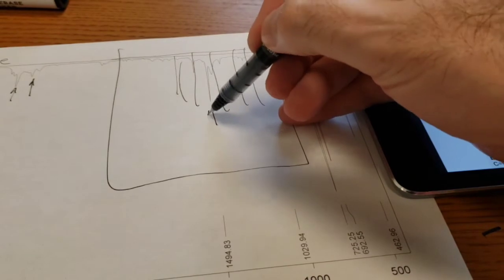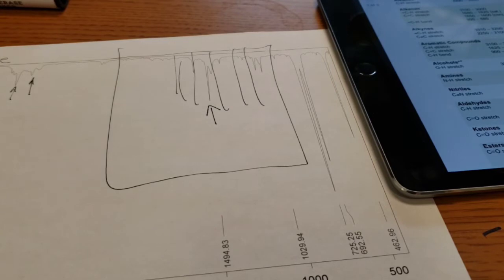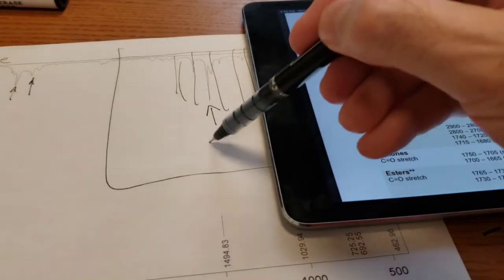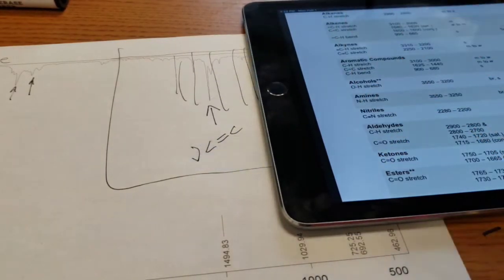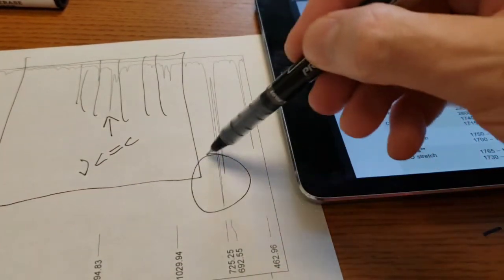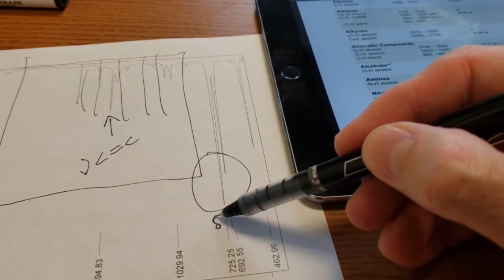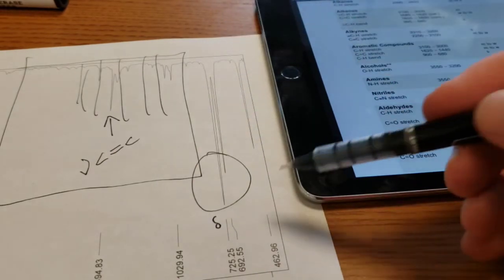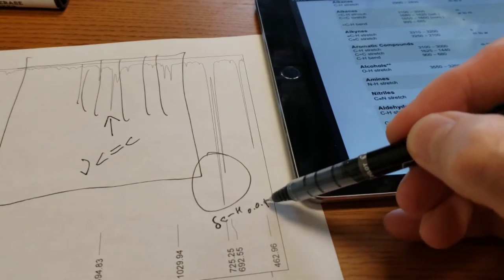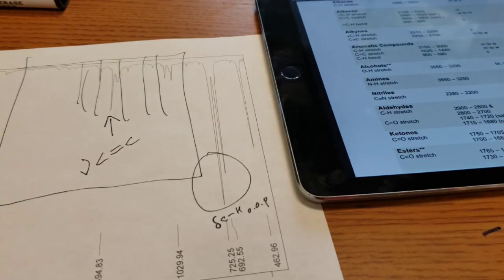But here I have one that stands out on its own, so I'm going to go ahead and see if I can find what that represents. And it's in the region right here for a carbon-to-carbon double bond stretch. And then I have two very strong lines right here. And these represent bends. We find bends at these low wave number values. And these are carbon-hydrogen out of plane deformations. These are bends away from the plane of the planar aromatic ring.